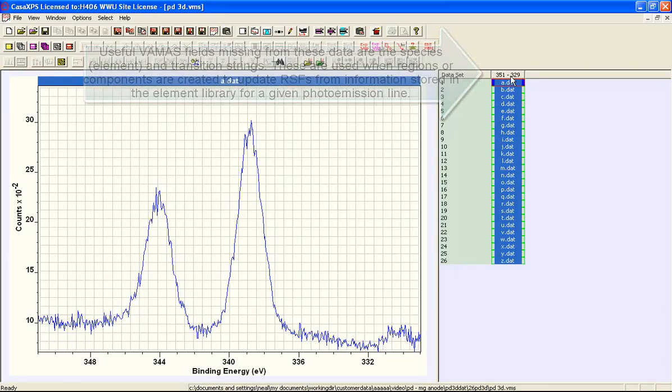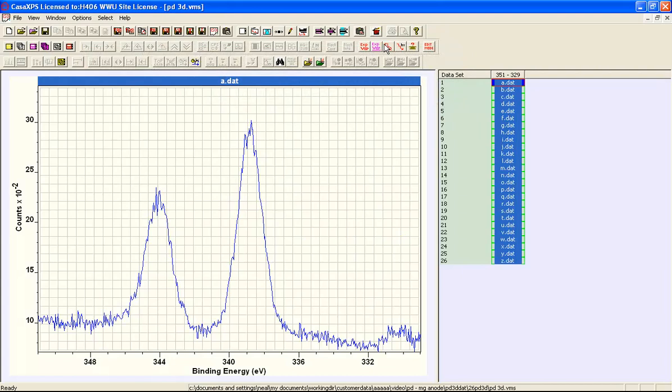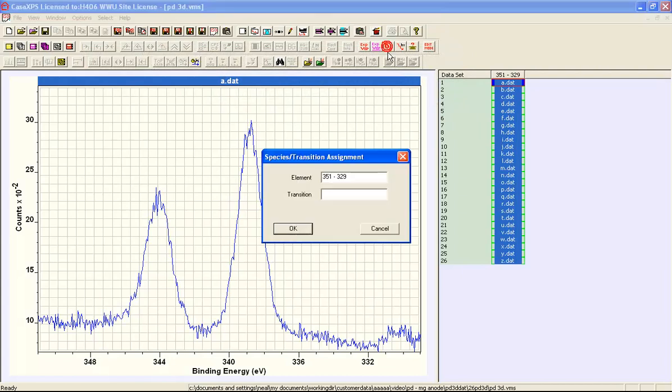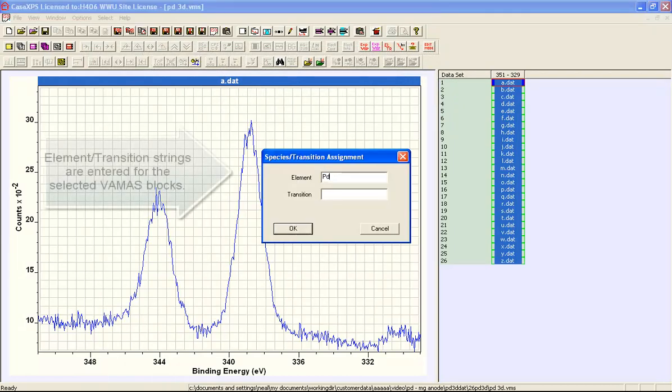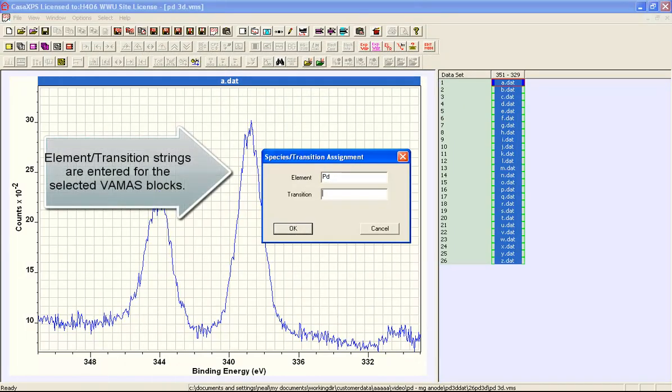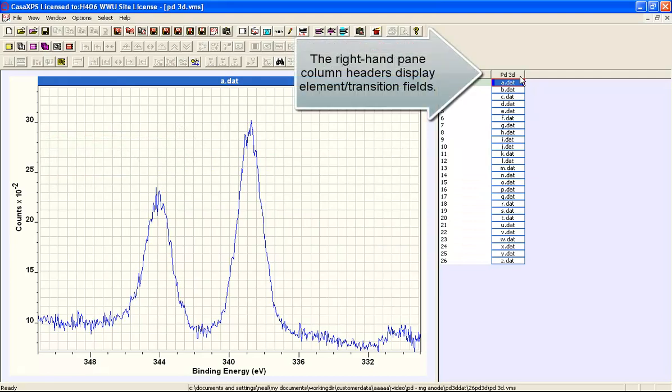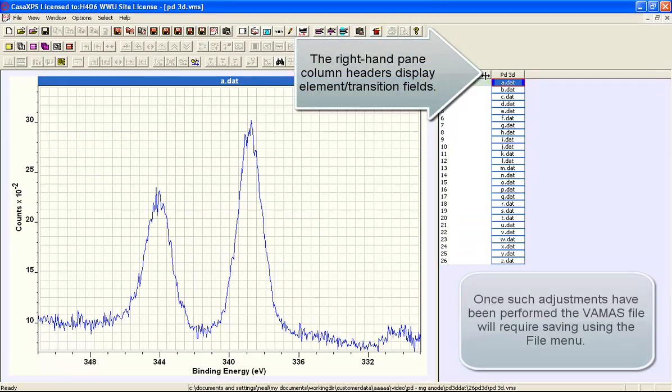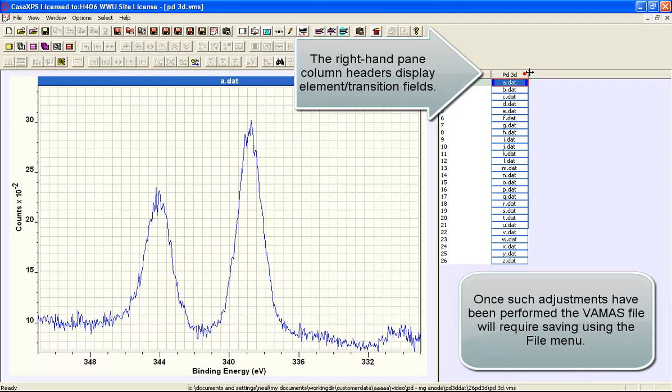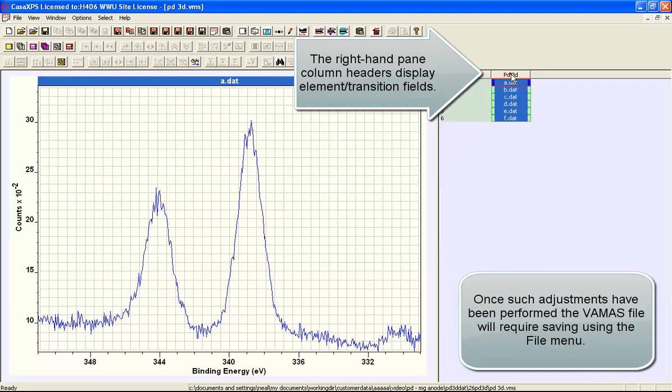So having selected these we can look at the element transition field and assign the palladium 3d. And when I press OK the new element transition field has been applied to these data.